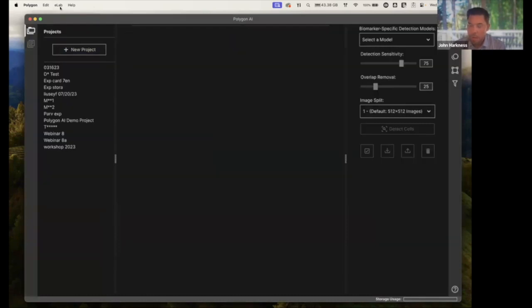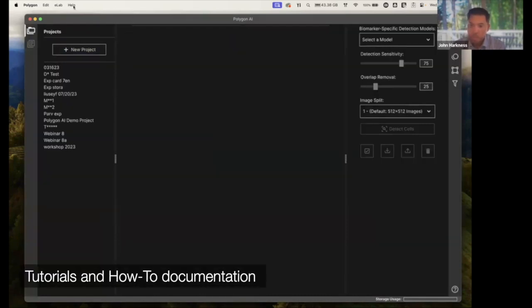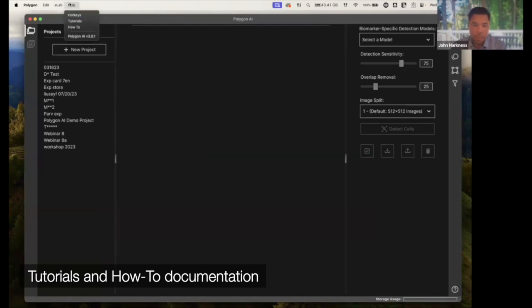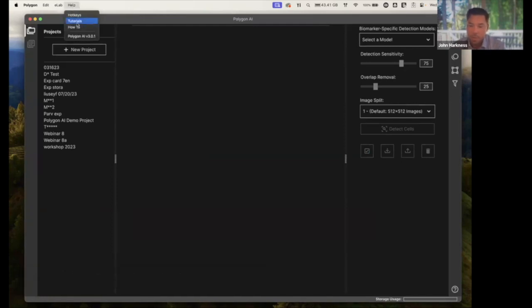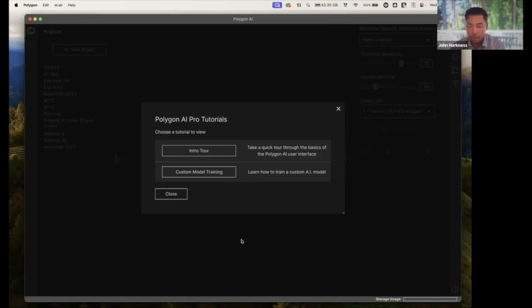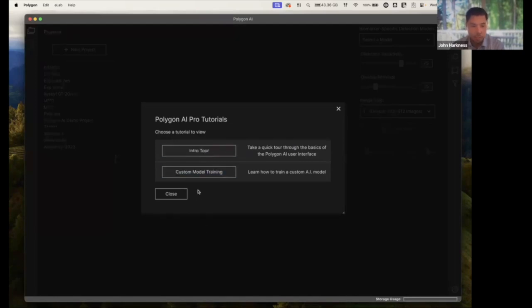The other thing that's really useful in Polygon is we have a really nice help and tutorial section. Right up top, I've got access to some tutorials that are going to walk me through some of the functionality in Polygon. These are interactive tutorials that might show me how to build a custom model or to do single label analysis or just where some of the buttons are. If you're getting going and struggling or have any questions, this is a great place to start.